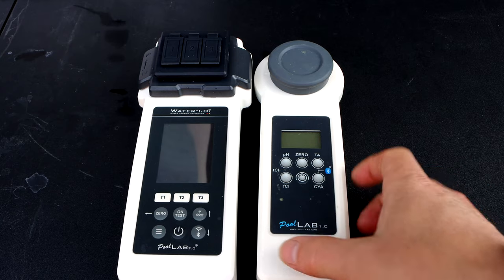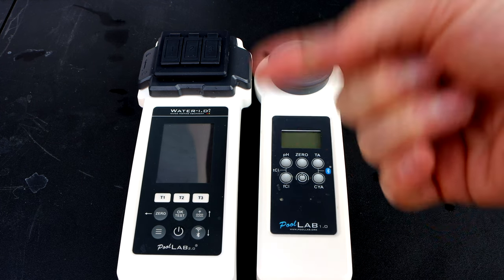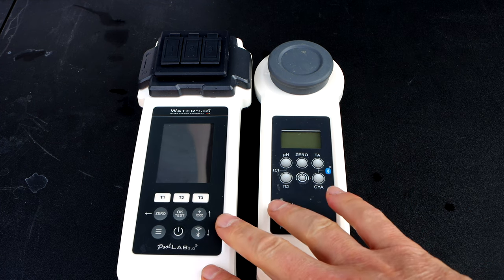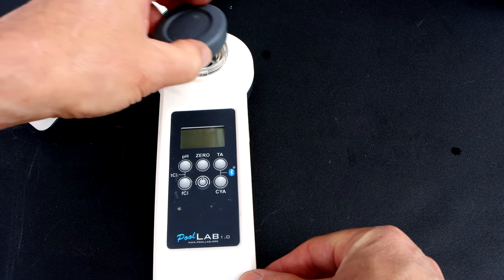I've been using the Pool Lab 1.0 for many years now and I'm really glad they came out with the 2.0. There's a lot of advanced features here over the 1.0. For comparison, I'm going to use the same water sample in the Pool Lab 1.0.